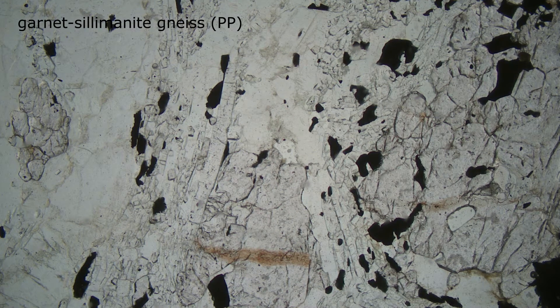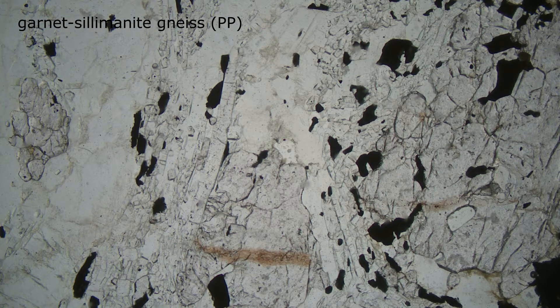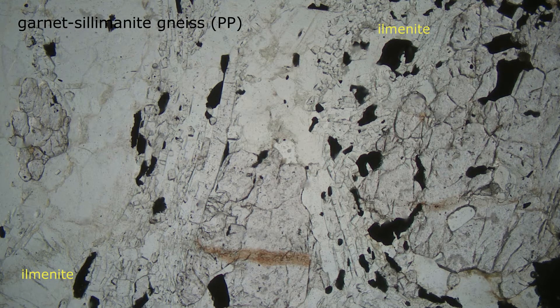Here we see a thin section view of a garnet-sillimanite gneiss in plain polarized light. The opaque grains showing in black are ilmenite. Ilmenite is one of the most common of the opaque minerals in thin section.